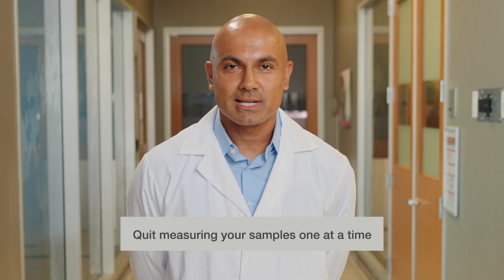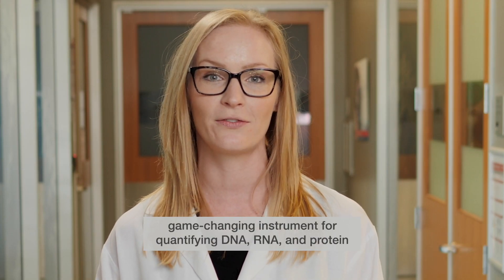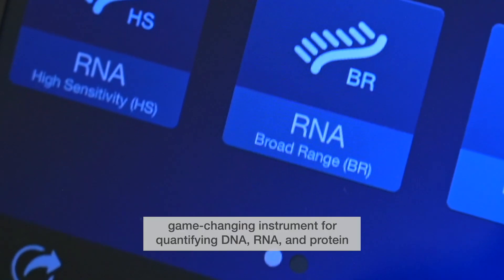Quit measuring your samples one at a time. Get ready — the first of its kind, groundbreaking, cutting-edge, game-changing instrument for quantifying DNA, RNA, and protein.